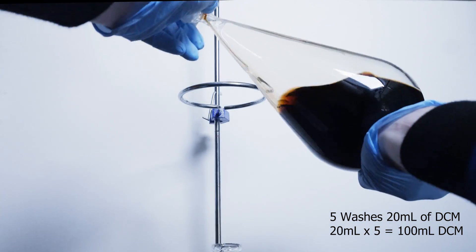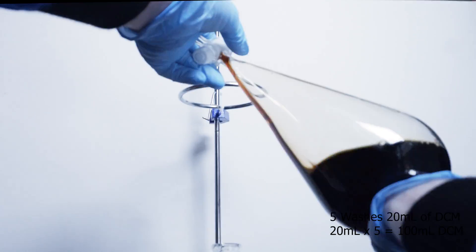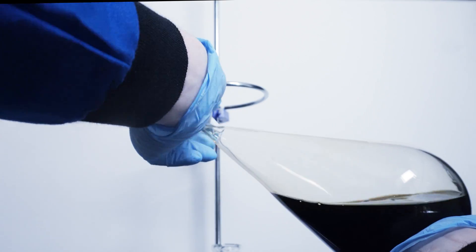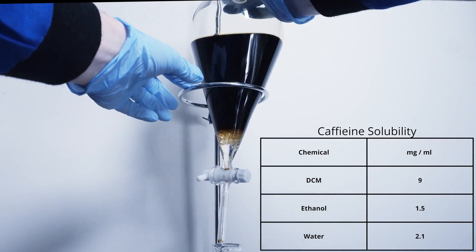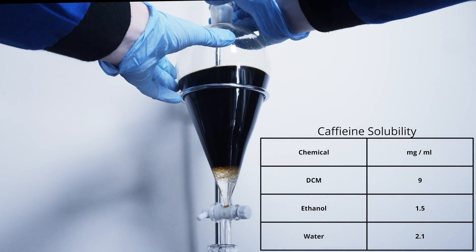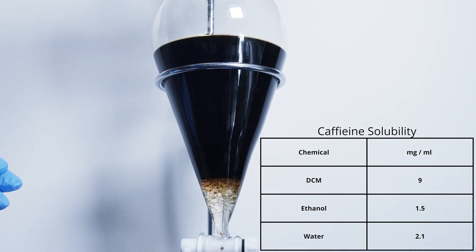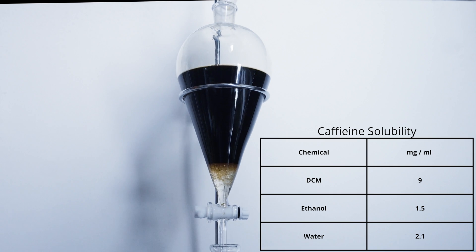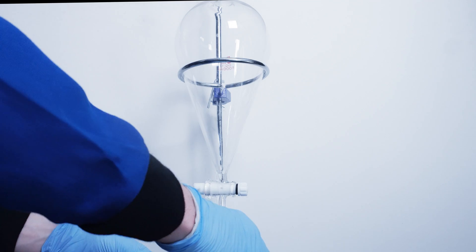Each wash involves capping, shaking, and continuously venting my funnel. This is extremely important because there will be a lot of gas building up, so every few shakes I vent the bottom of the funnel to release this pressure. The caffeine is more soluble in DCM than water so it will prefer the DCM — this is what's happening when the DCM is being shaken through the water. Some tannins also get brought along with this and it discolors the DCM to a yellowish color. After my final washing I drain everything into a waste container to deal with later.